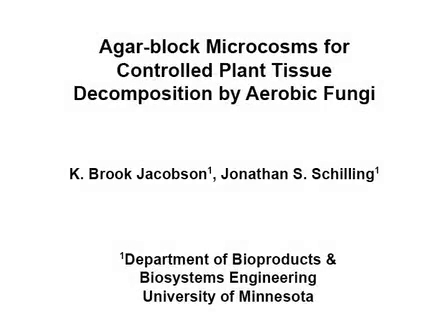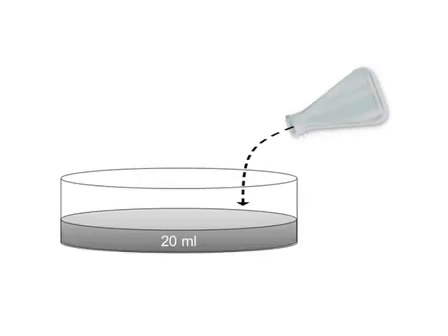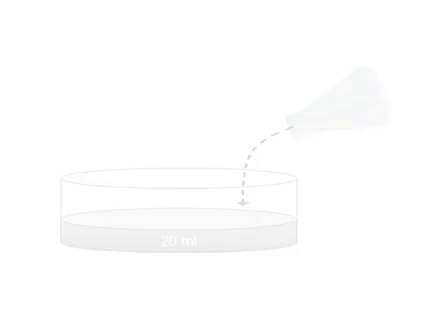The overall goal of this procedure is to inoculate an aerobic wood-degrading fungus in a petri dish microcosm where wood moisture and exogenous substrates are tightly controlled. This is accomplished by first preparing microcosms with exact volumes of known agar media.